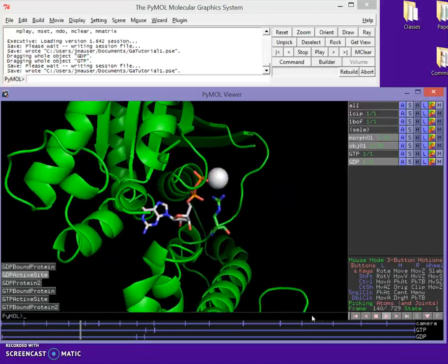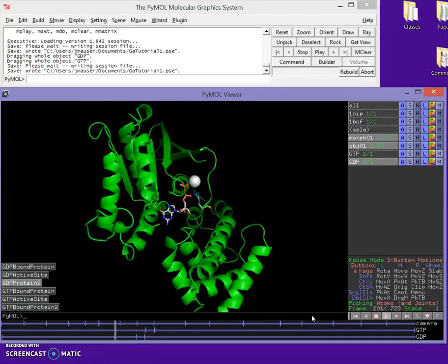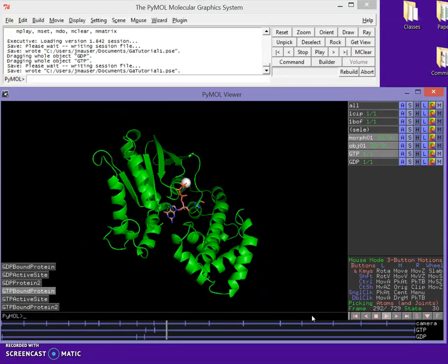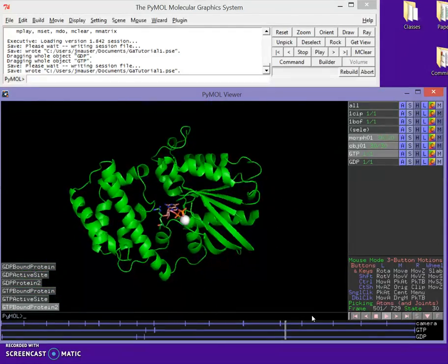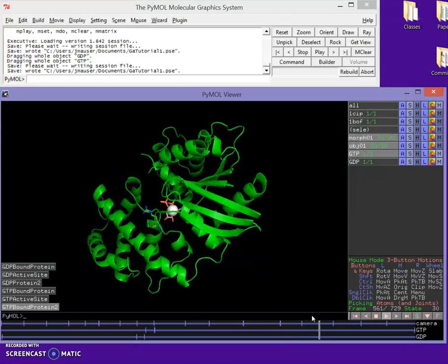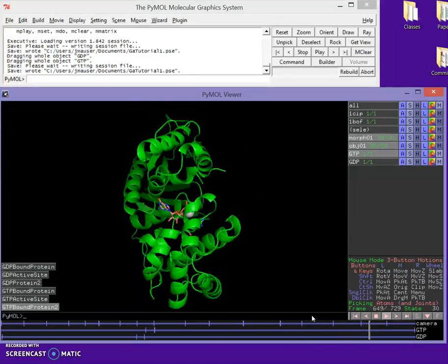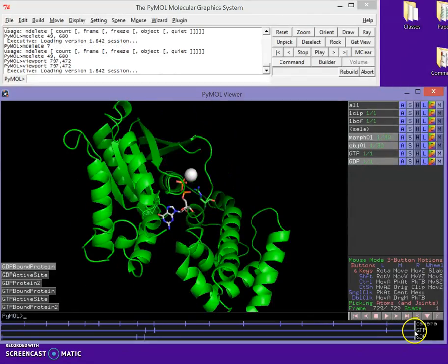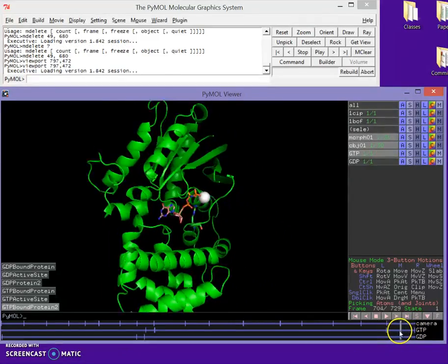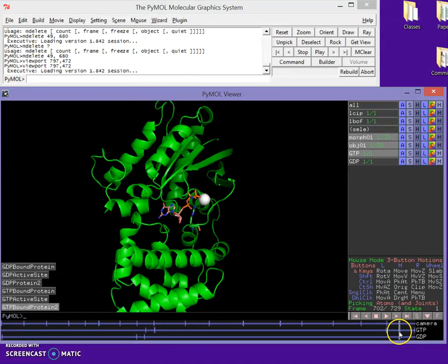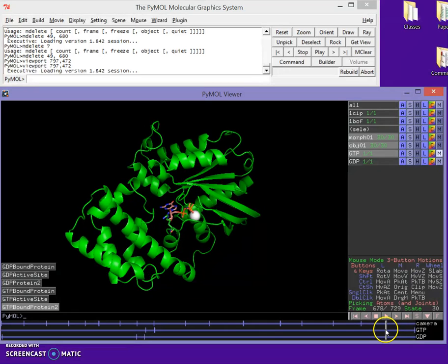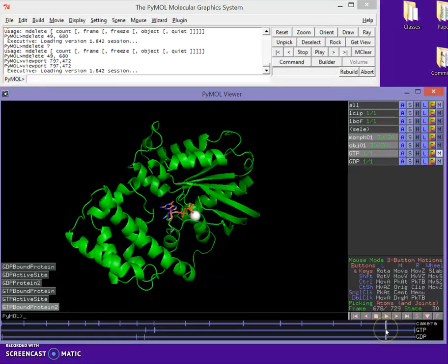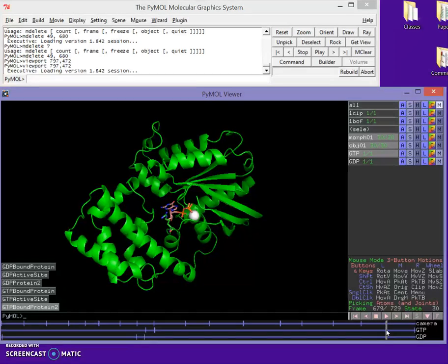Looks nice. Okay, everything's visible. Nothing bouncing in bugs. That looks really good. That looks great. Good enough for me. So I definitely don't like this last little bit where it switches to GDP for some reason. I don't know why that happened, but if you ever want to do something where you're editing, you can do it manually. It looks like we have some pretty good data here from about 679 on.